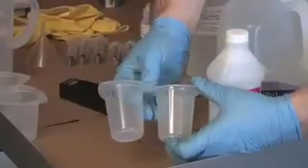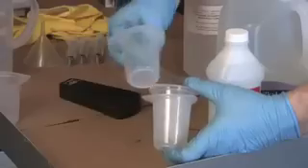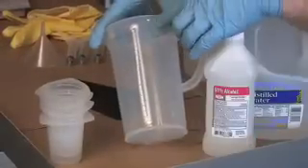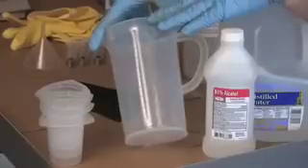You're also going to need some containers to do your titration in. These are just simple little cups with milliliter markings on the side. If you hit your local grocery store you can find some of these, usually in the kitchen aisle. You're also going to need a container that has graduations clear up to a full liter, because this is what we'll mix our titration solution in.